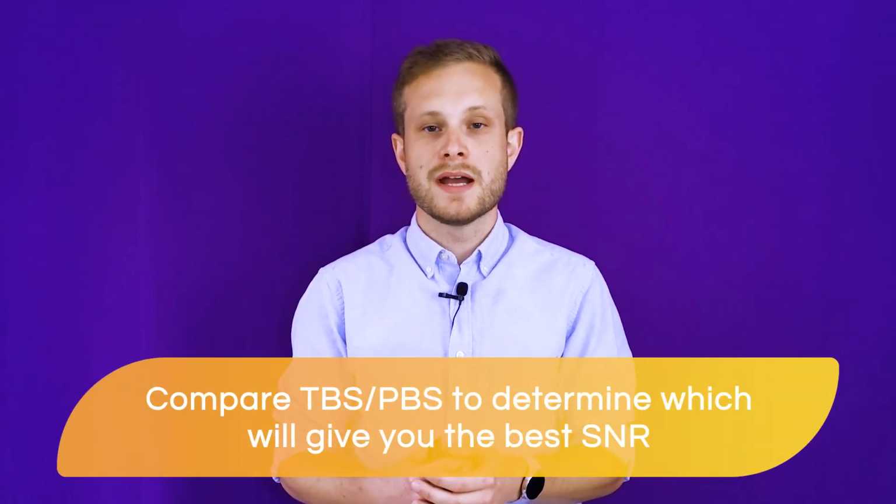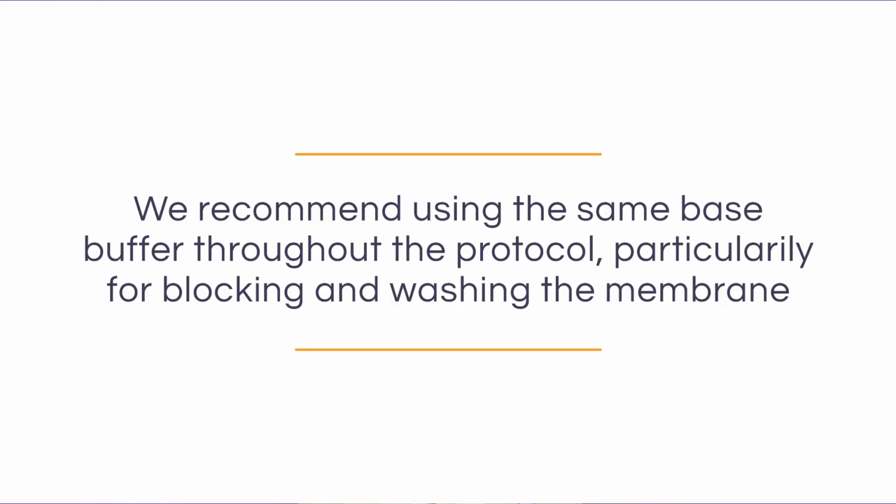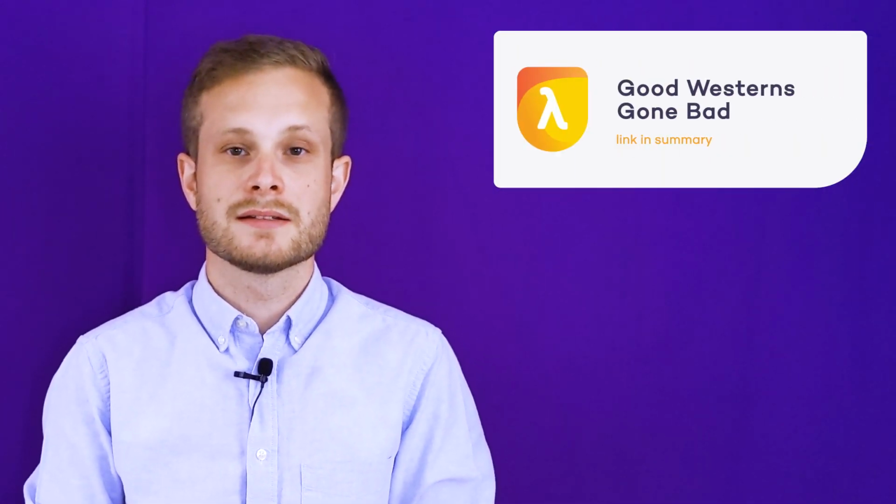The buffer that you will choose depends on your particular proteins of interest and the antibodies that you are using. We recommend that you compare whether TBS or PBS gives you the best signal and the lowest background, specifically for your targets and antibodies. We also recommend that the same base buffer is used throughout the whole protocol, and particularly for blocking and washing the membrane. If you do experience any high background issues, please consult Good Western's Gone Bad, our troubleshooting guide, which is linked in the summary. Although TBS and PBS-based blocking buffers are often interchangeable and can be quite similar in performance, we still recommend that you test both to ensure that you choose the best one for your targets.